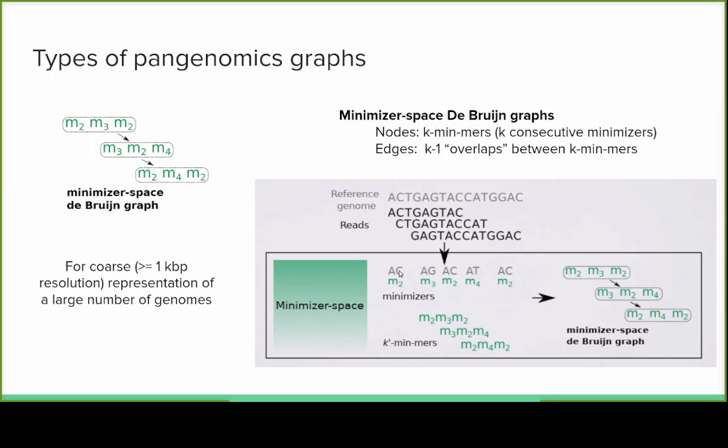You extract minimizers from this genome. And the way the minimizers are extracted, I could talk for a while about it, but just think of it as you have a predefined set of minimizers that you expect to find. And as soon as you find them, you will keep track of them in the order that they appear in the genome.